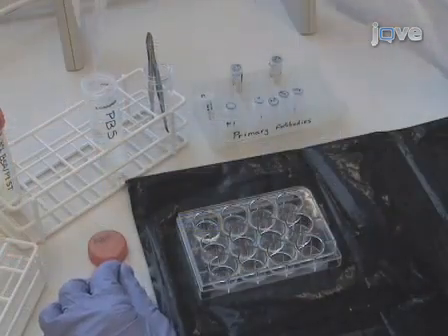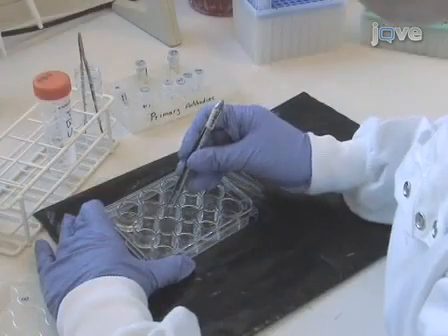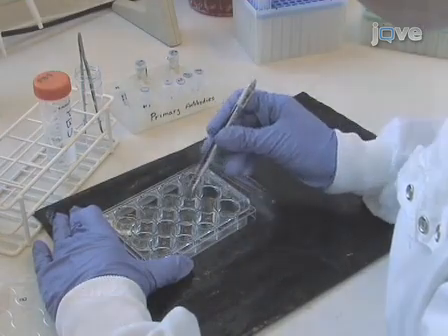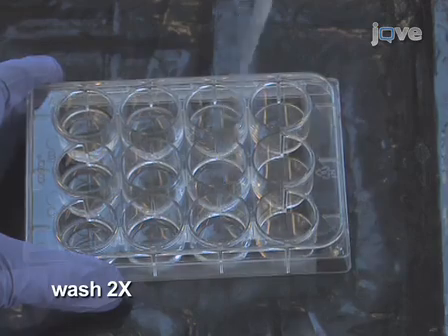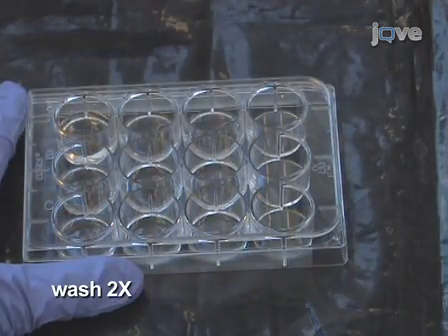At the end of the incubation, add 200 microliters of PBS to the well. Lift the cover slip and place it in a new well containing 500 microliters of PBS. After 5 minutes, remove the PBS by pipetting and then add fresh PBS. Repeat twice and transfer cover slips to a new dry well.